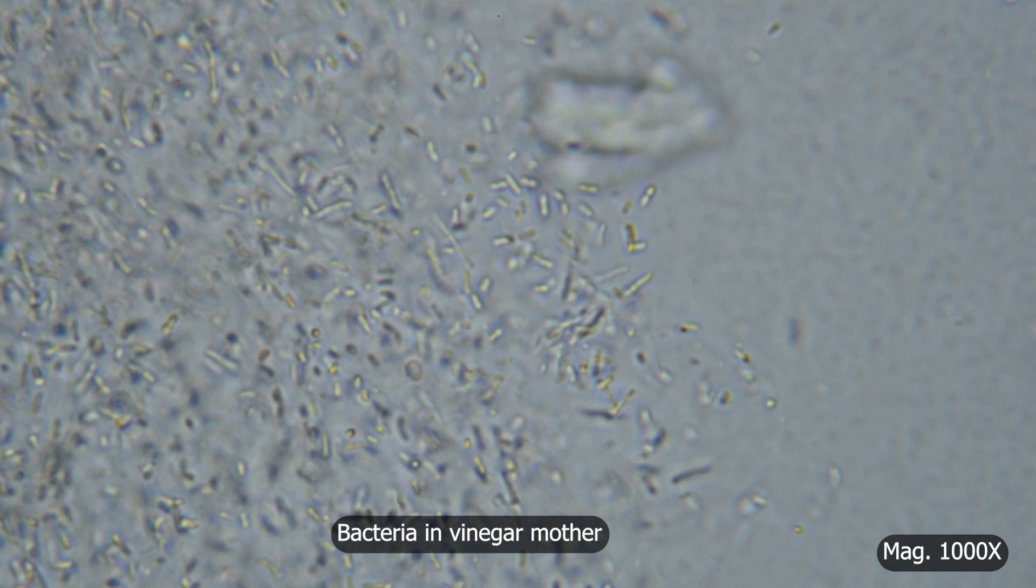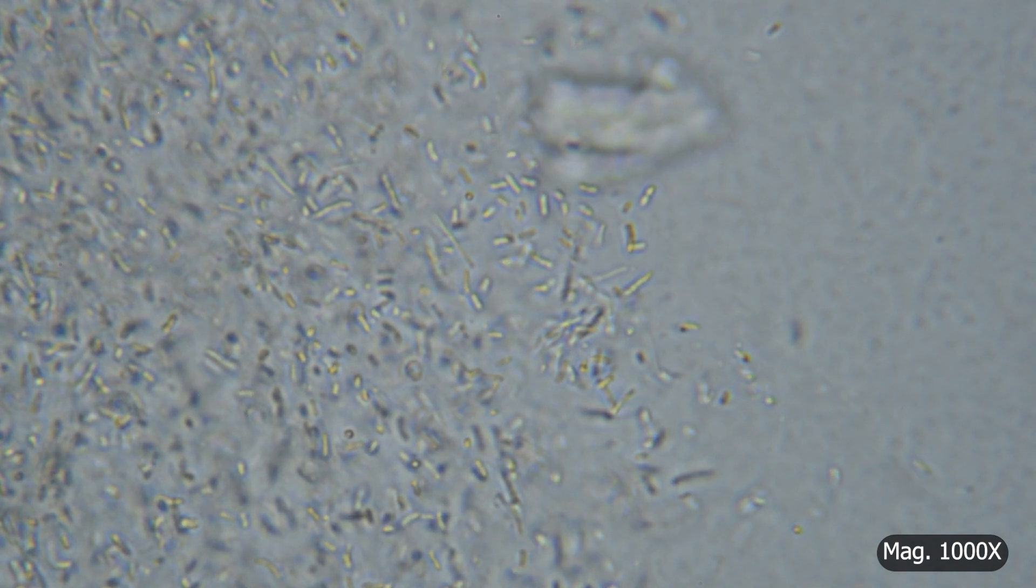Cellulose is incredibly tiny. It can't be seen with the light microscope, which is the type I use. I thought I wouldn't be able to show the cellulose, but while filming, I noticed something.